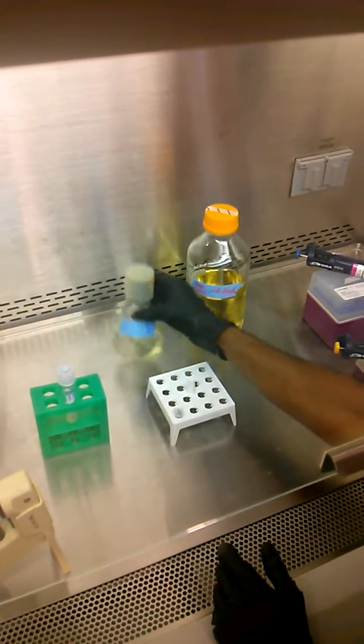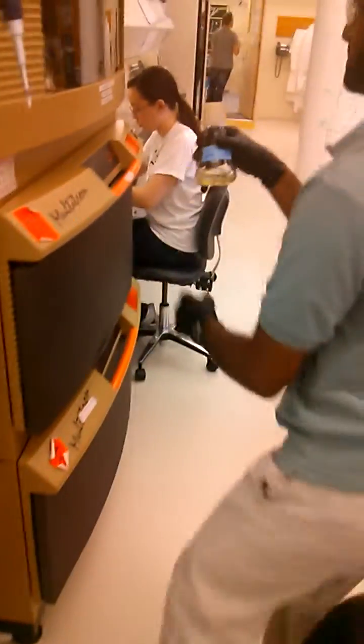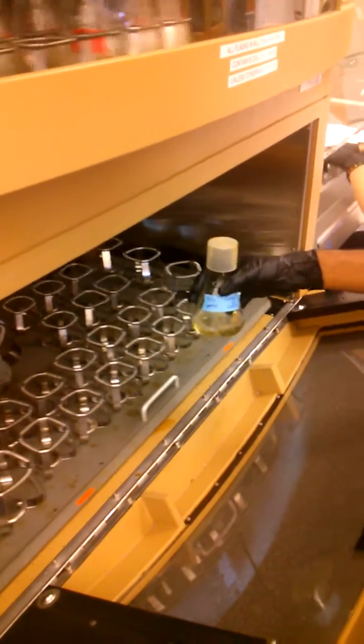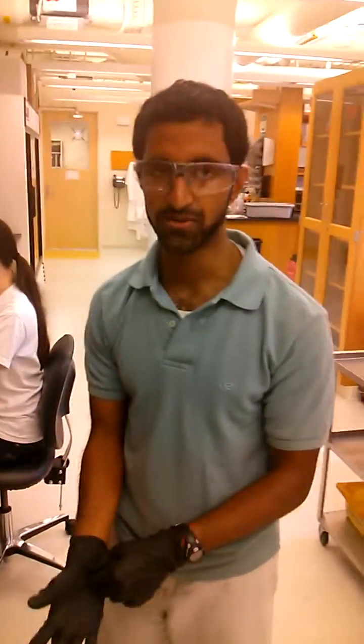My flask is all set. I'm going to take it out and put it at 37°C and wait for it to stop shaking. I'll set it right there, and then we'll check back on it in about two and a half hours.